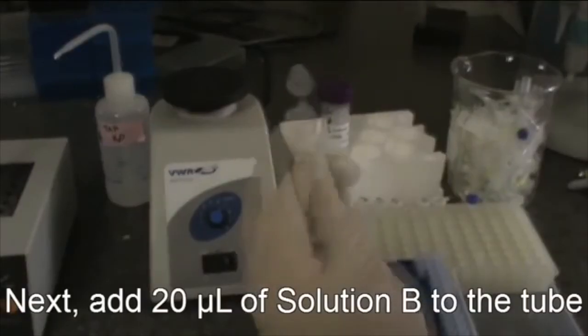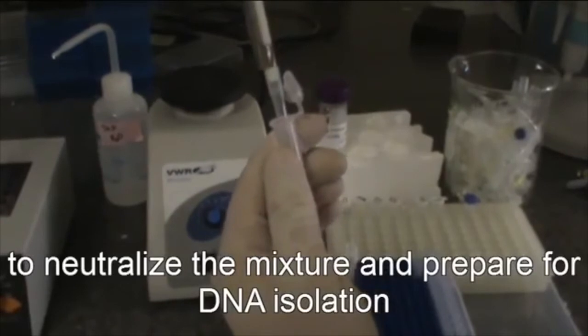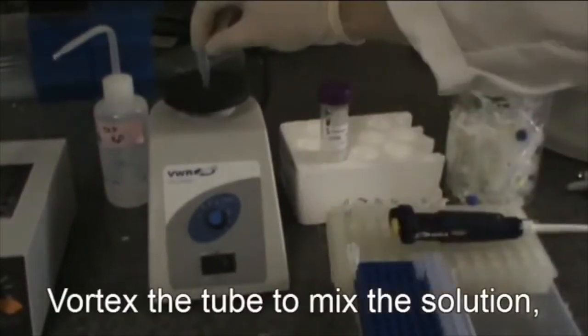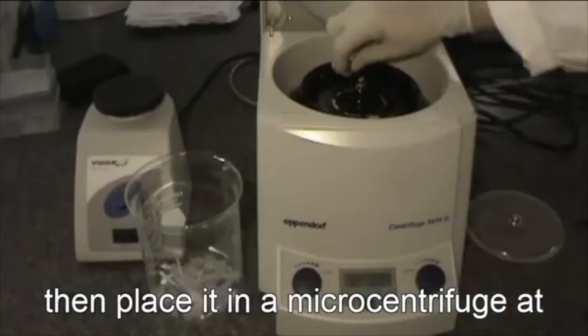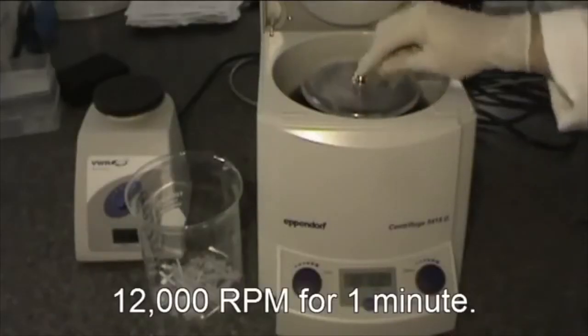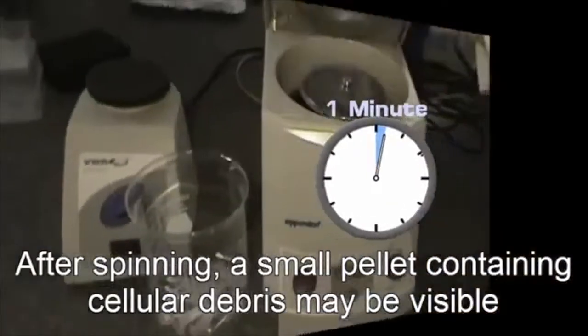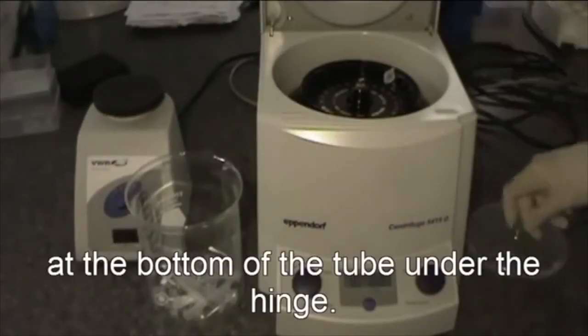Next, add 20 microliters of solution B to the tube to neutralize the mixture and prepare for DNA isolation. Vortex the tube to mix the solution. Then place it in a microcentrifuge at 12,000 RPMs for 1 minute. After spinning, a small pellet containing cellular debris may be visible at the bottom of the tube under the hinge.